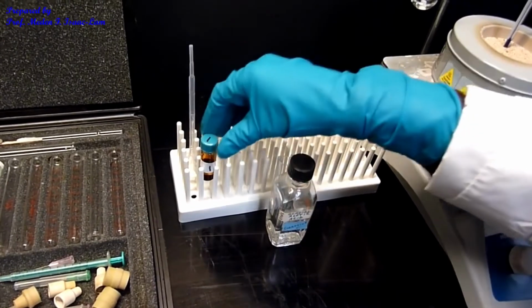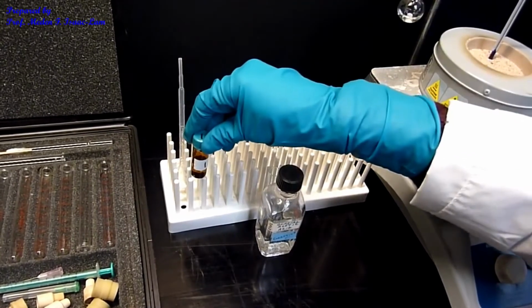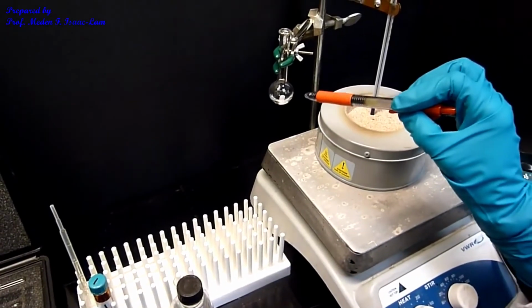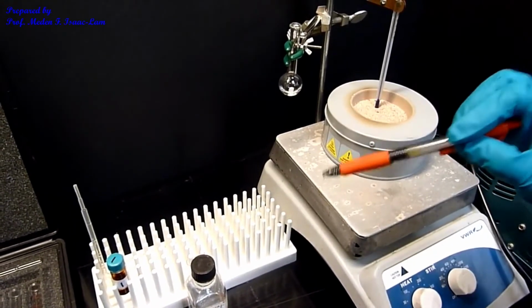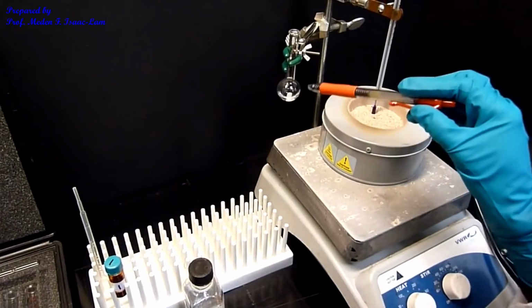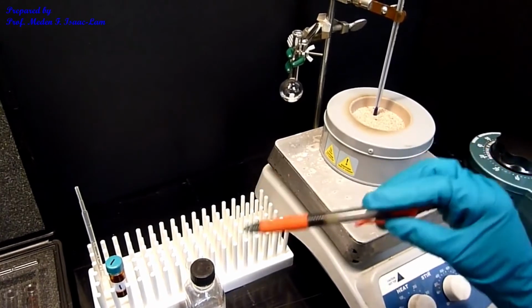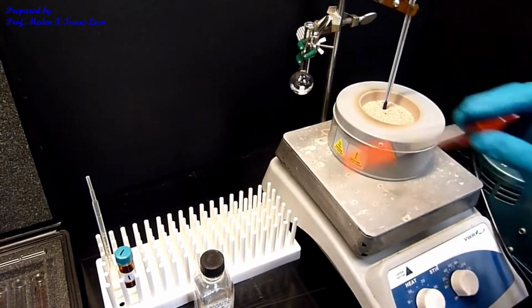And then I also have the alcohol, which we label typically as an unknown. This is unknown one. So we are going to determine the identity of the unknown alcohol once we make the ester. I measured about 1.2 mL of the acetic acid, and then from the table that I've shown you in the handout, I approximately determined the amount of alcohol, which is about a stoichiometric amount, a 1:1 ratio of the corresponding alcohol, and I'm going to add approximately 2 mL of the alcohol in here.